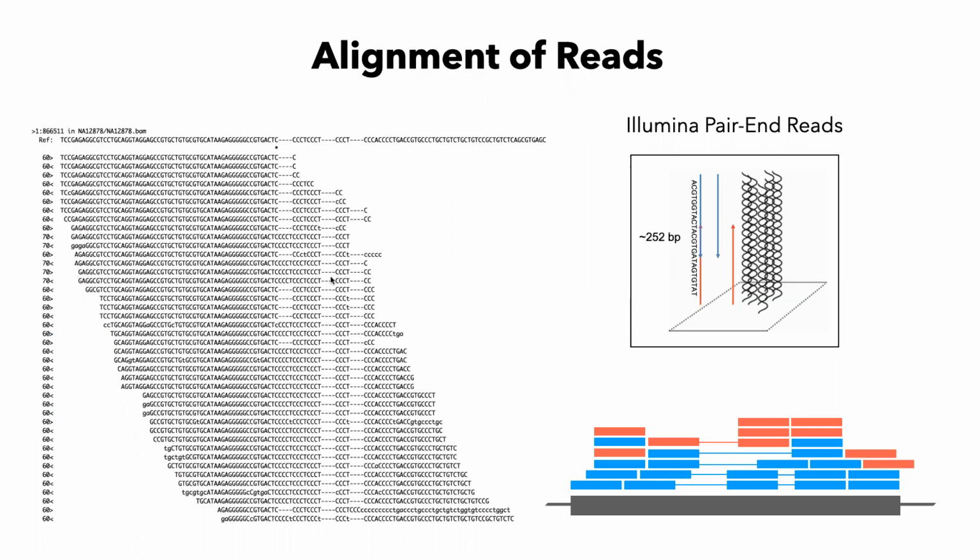Now, there is a benefit to Illumina paired-end sequencing that gives you higher confidence about the particular position, each nucleotide. And so many times when we talk about Illumina metagenomic MiSeq type of Illumina sequencing, those are going to be paired end. And so that's just an important part to understand.